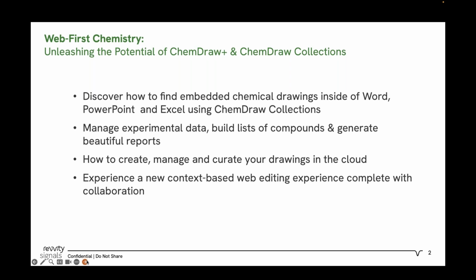Additionally, we will be talking about the ChemDraw Plus application, which is a new application launched just this February alongside Signals ChemDraw, a fully web integrated ChemDraw application, which allows you to manage and curate your drawings in the cloud. We'll be able to show you some new improvements that we've made there and give you a new context-based web editing experience.